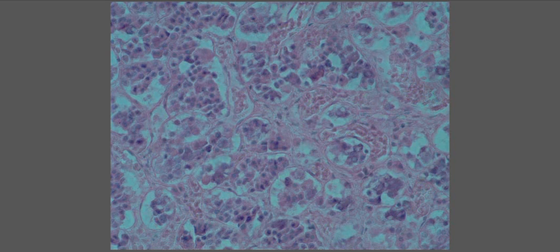All right, group one. What is group one? What is this? What gland is being shown here? We passed? So, if I show you this, will that be easier?